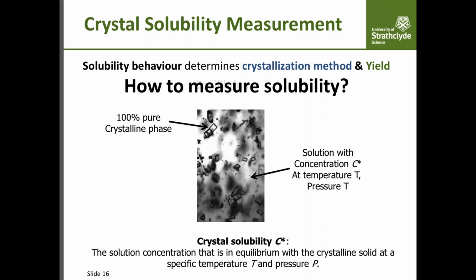Well, it might take a long time, but that is the right definition for solubility. So here we have a suspension, and we have a very pure crystalline phase, and the surrounding solution has the concentration which is equal to the solubility.